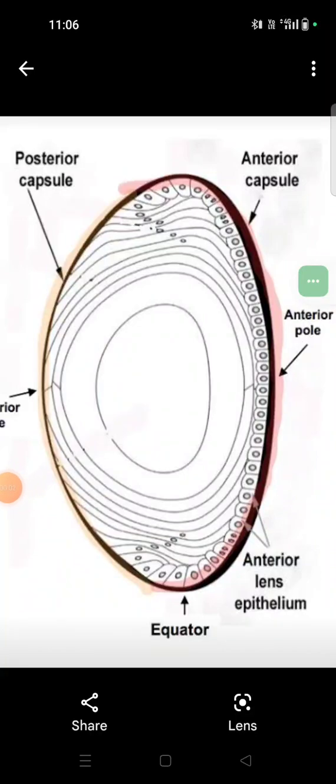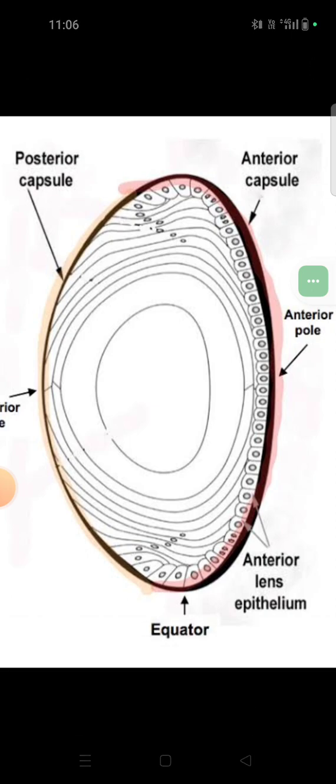Have a look at this image — this is the microscopic structure of a lens. Observe the markings: the anterior capsule, the anterior pole, the anterior lens epithelium, equator, posterior capsule, and the posterior pole. Observe the equator part, where there is active proliferation of the lens. Note that there is anterior lens epithelium but there is no posterior lens epithelium or posterior lens epithelial cells.